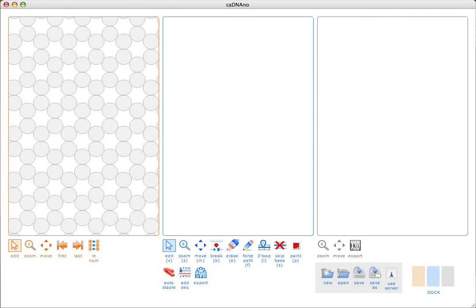The goal of this tutorial is to demonstrate enough of the CAD nano interface so that you can start making arbitrary three-dimensional DNA origami shapes. Typically, we use M13-derived scaffolds, which are over 7,000 bases long. To keep things simple, I'm just going to build a small six helix bundle nanotube.